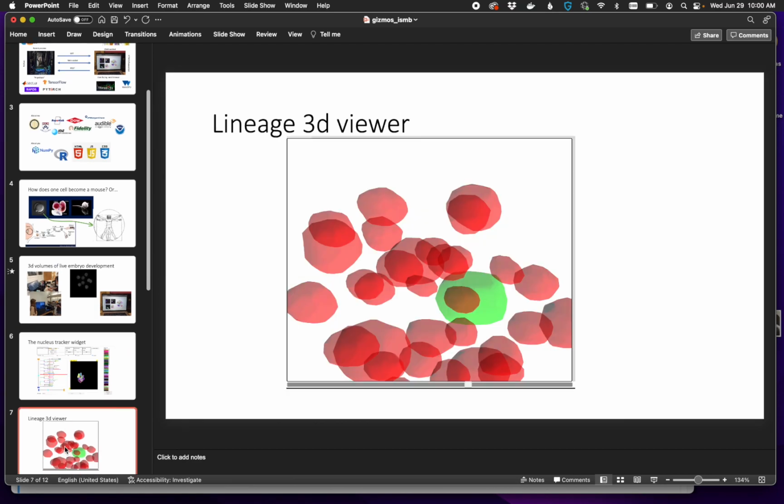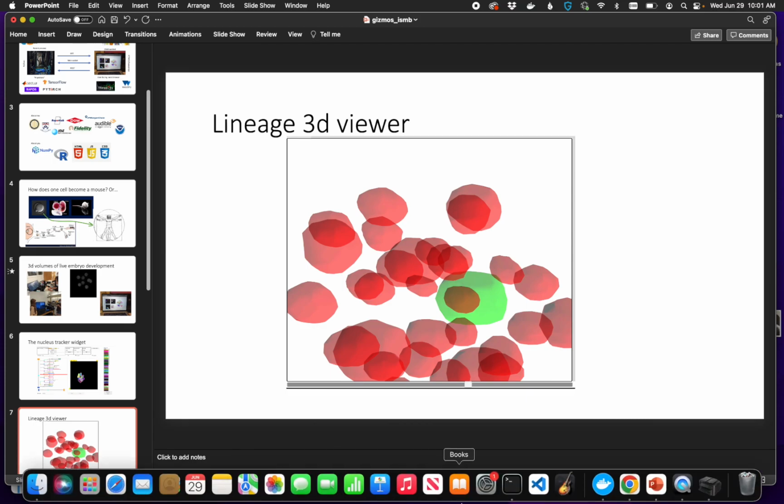It is also instructive to look deeper into the geometric structures of the embryo cell lineage to see the changes in size and shape of cell structures as they evolve and divide over time. The 3D lineage viewer allows a scientist to view, rotate, and zoom the geometry of cell structures while moving between timestamps. So let's start an example of the viewer and see how it works.